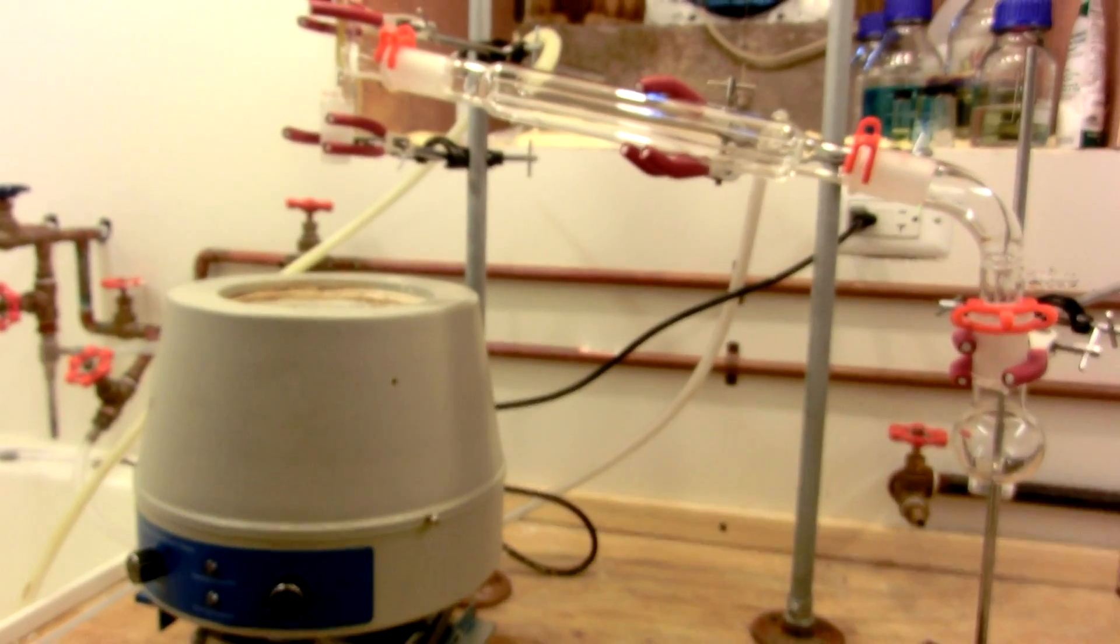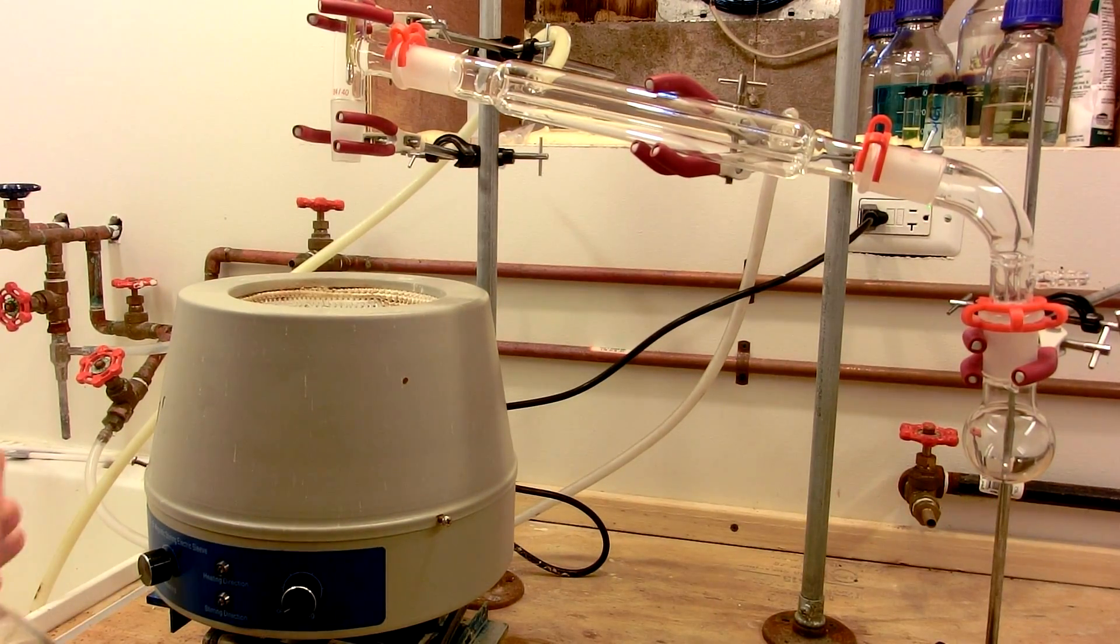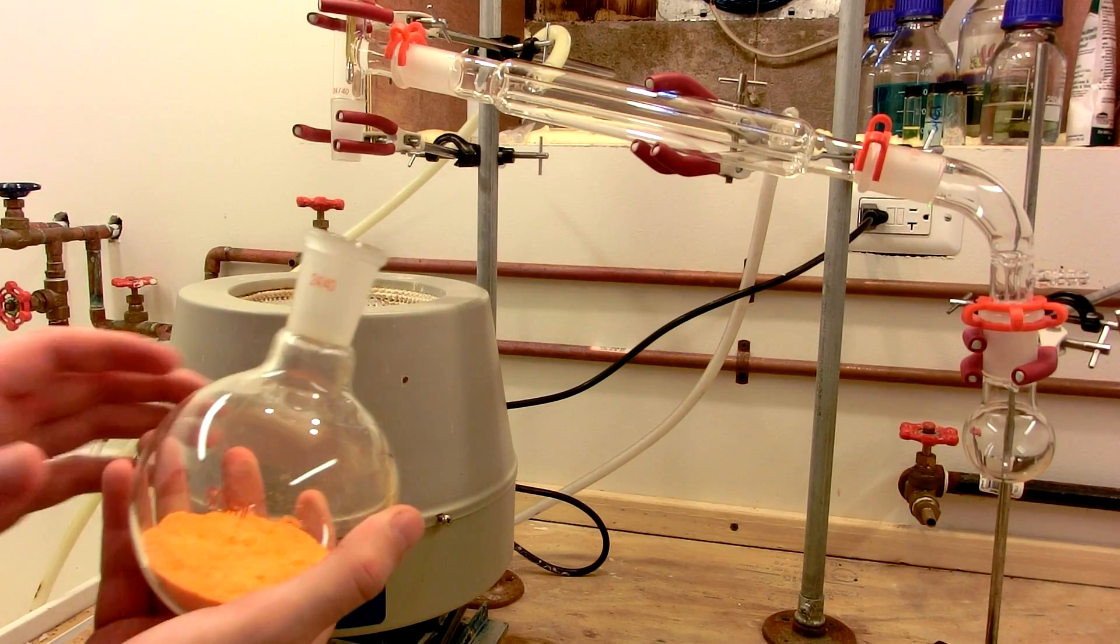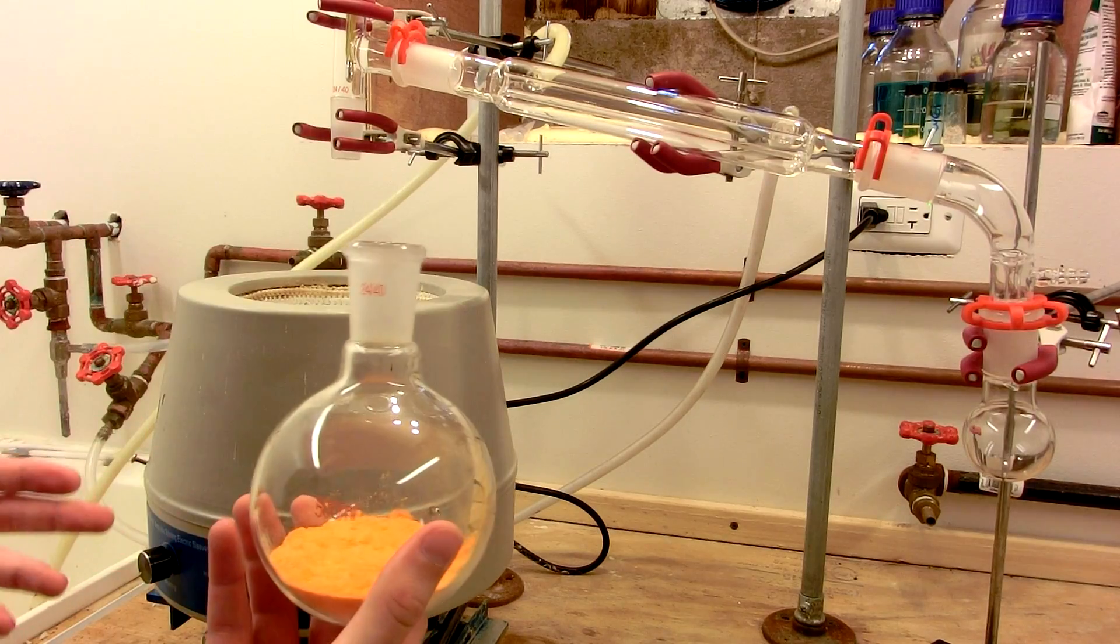Once the reactants are charged into the flask, set up for simple distillation. I have a 50 milliliter receiving flask here, since the theoretical yield should be about 33 milliliters of chromal chloride. Don't connect up the boiling flask yet, because we still need to add the sulfuric acid.